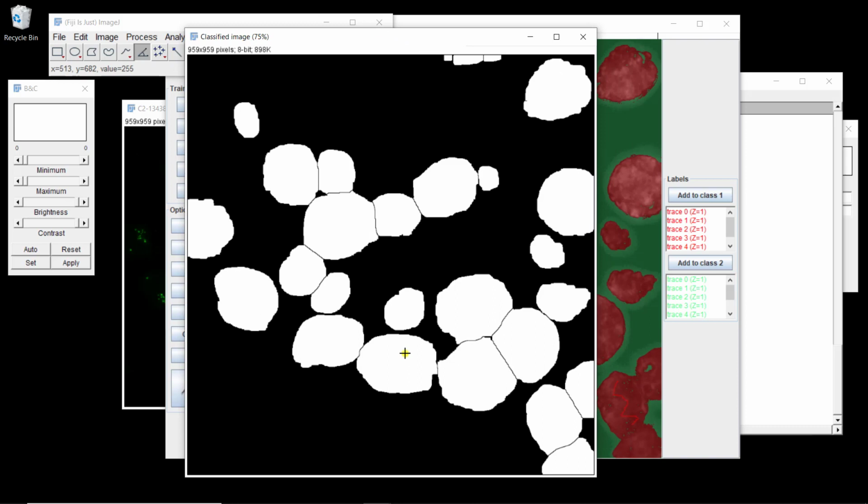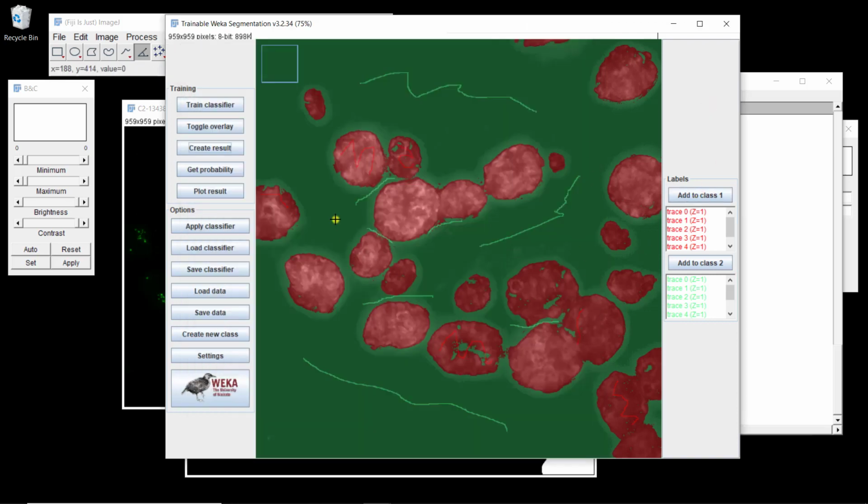So probably it would be good to go back to the results out of the machine learning and to do a better chain of mathematical morphology operations to have something that is more robust, because again the idea would be to apply this to many images, and here the number of dilations we made to get rid of this separation is something that is too sensitive, and I guess if we had a similar image we could get into trouble. The other possibility would be to keep going with the classification. Maybe open a new image, train with this classifier, and then improve on the other image. So we're not too close to this image, and we try not to overfit, what we call in machine learning overfitting the data.